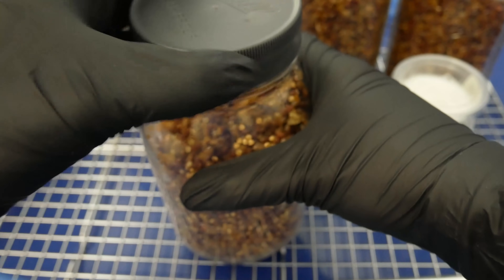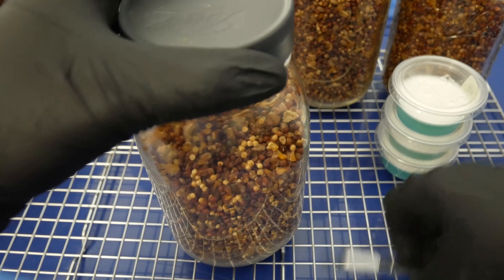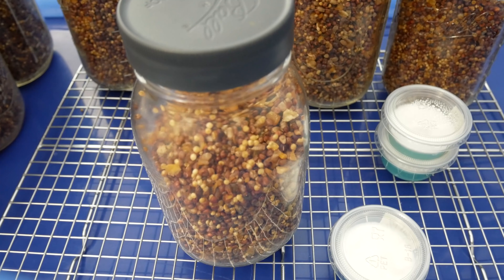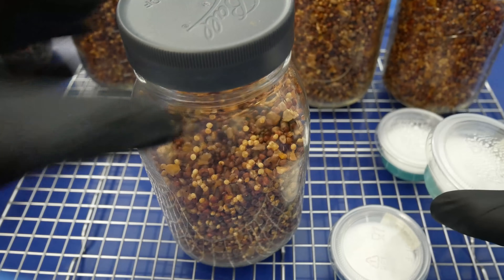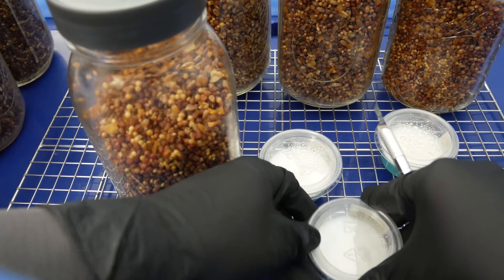Once you've inoculated the grain jars, I loosen up the lids again just to allow gas exchange to happen, and I'll leave these out on a shelf at room temperature to colonize over the period of three to four weeks. The rest of the process is going to be the same thing over and over — I'll go ahead and speed up the video here.